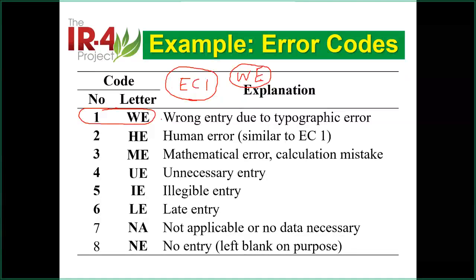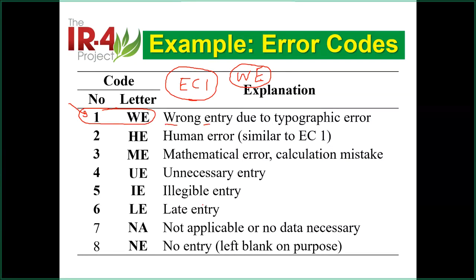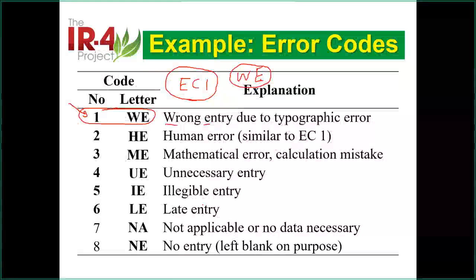Okay, so that WE stands for wrong entry. And this is most likely, more than 90% in your lab, that's the mistake. And there's some kind of human mistake. For example, if you run something, some other people come here. This happened one time in my lab. Someone is doing extraction and put a sample on the side, next to the sample. And some other people came here, took the sample and just did his. And you have to write this down.